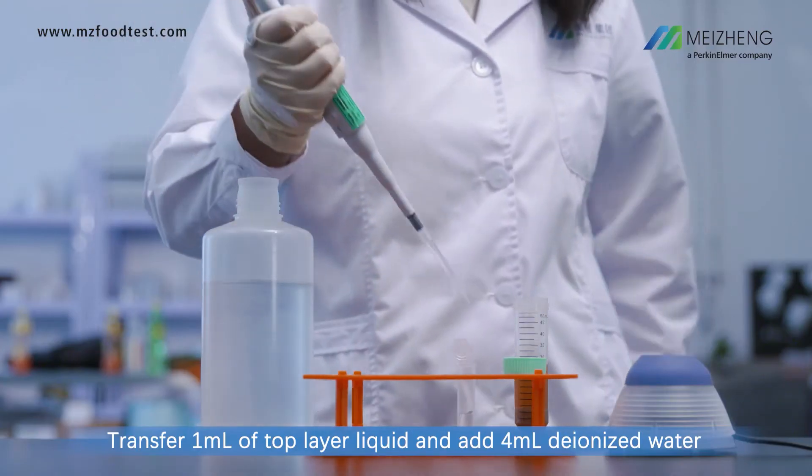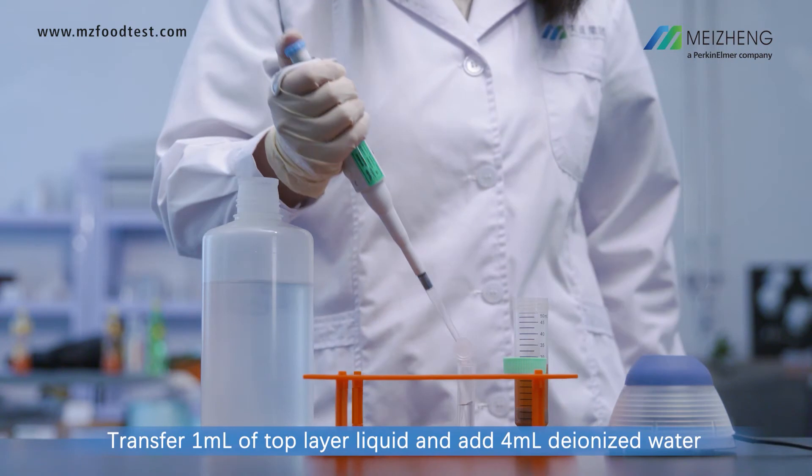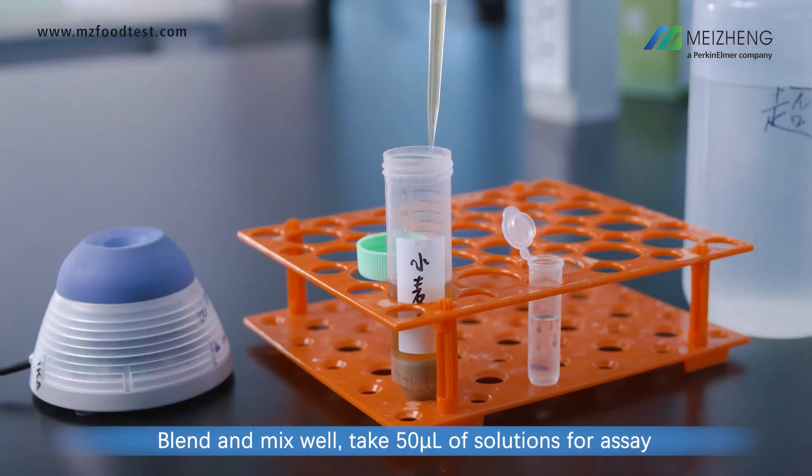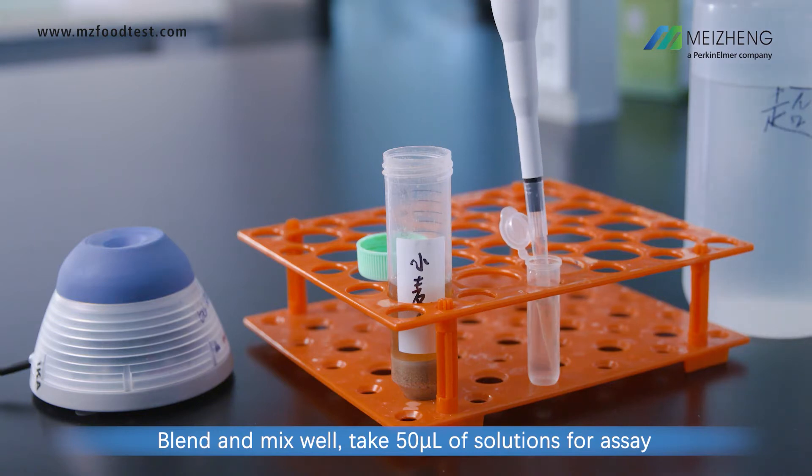Transfer 1 milliliter of top layer liquid and add 4 milliliters of deionized water. Blend and mix well. Take 50 microliters of solution for assay.